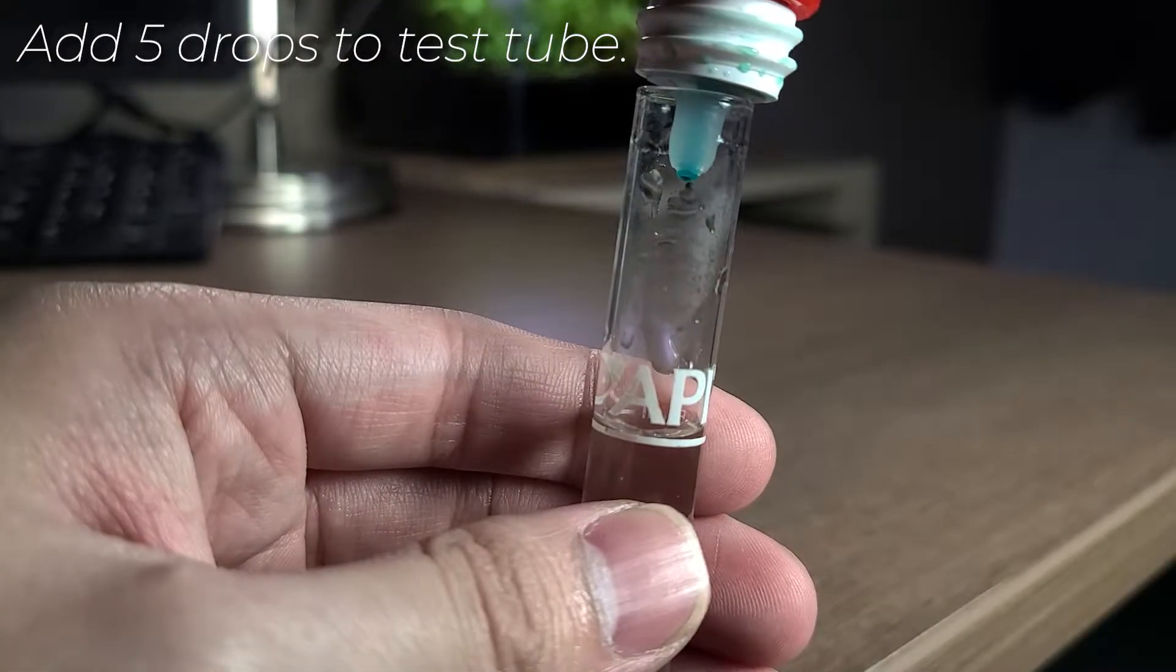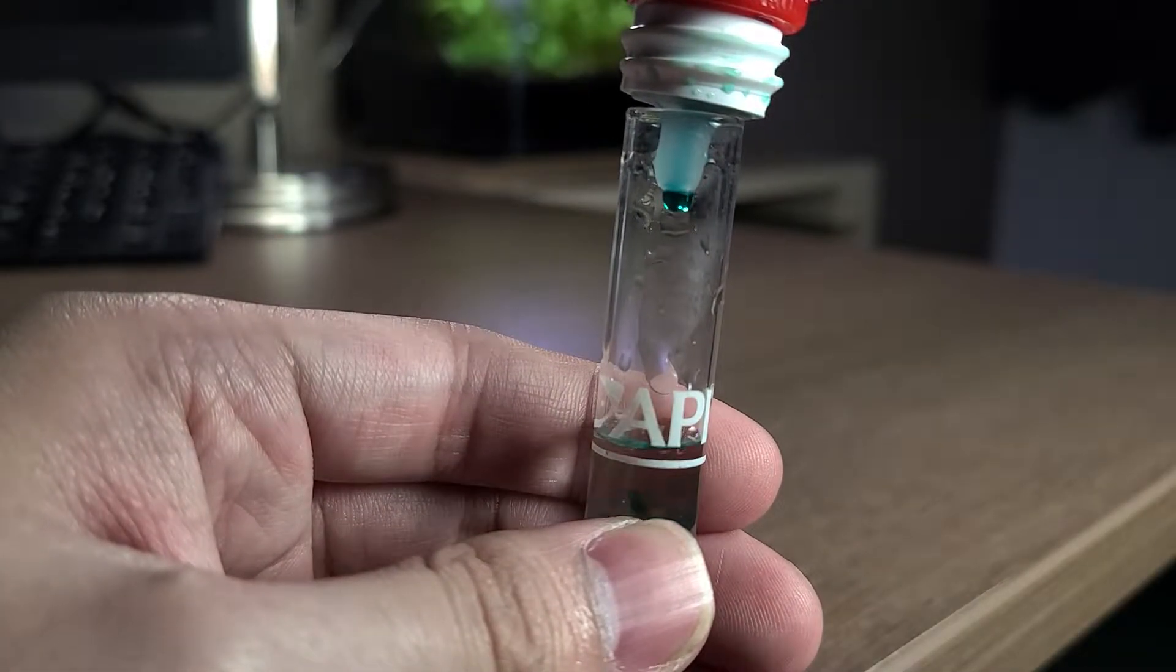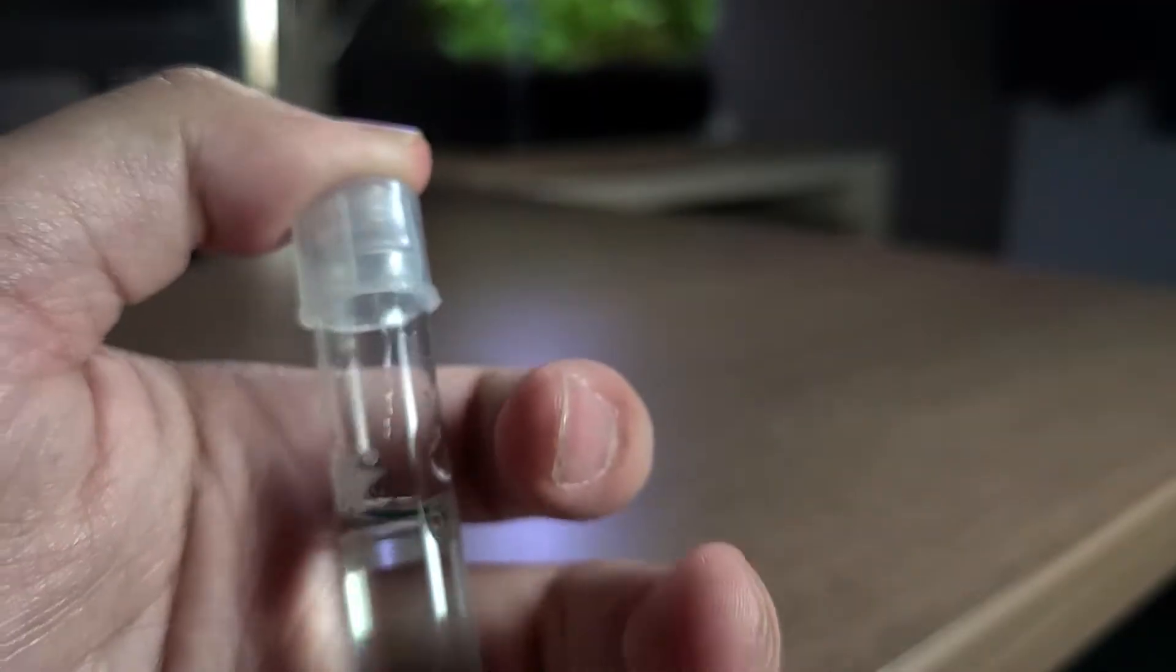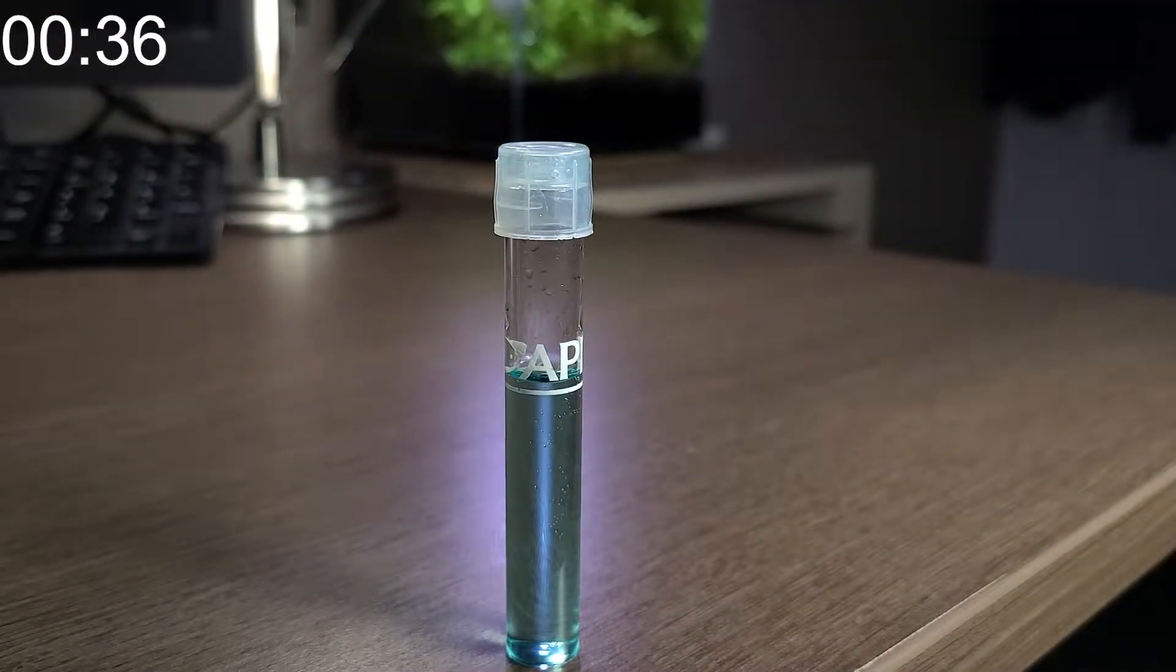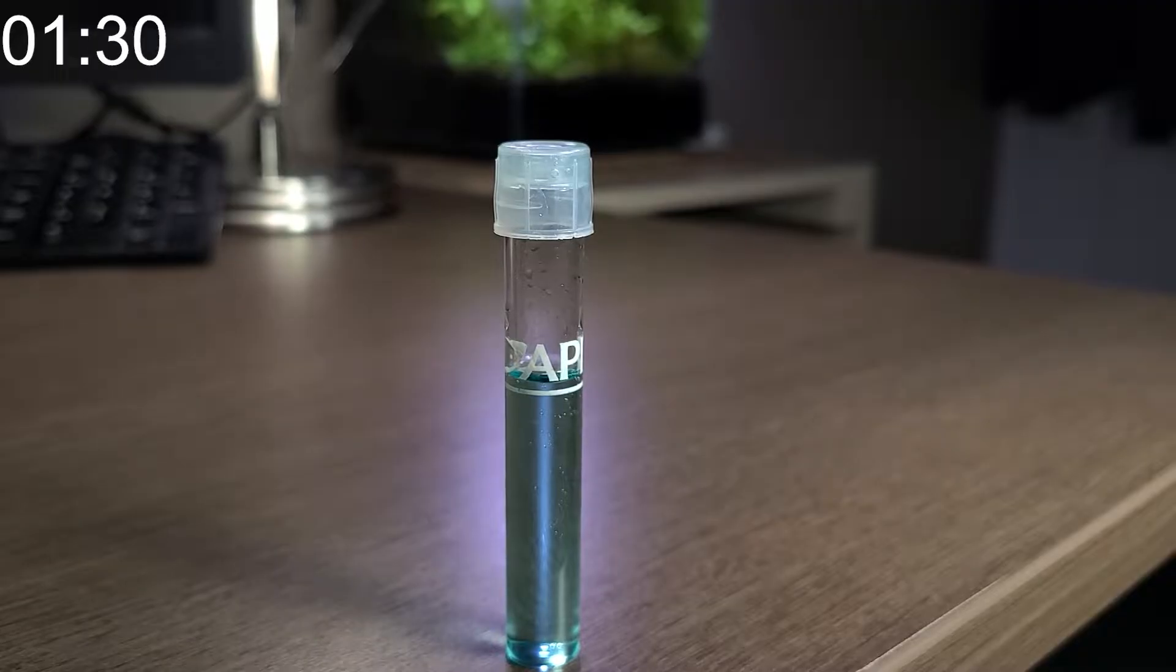For nitrite, we need to add five drops to the test tube. Give it a little shake and wait for five minutes for the color to develop, if any. Just like ammonia, we want this value to be zero at all times.